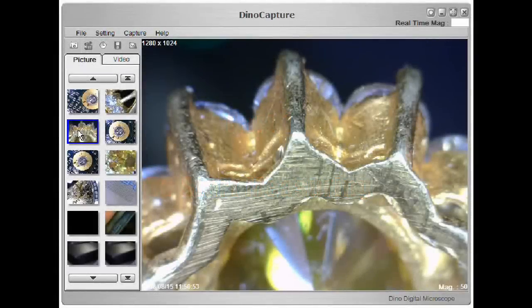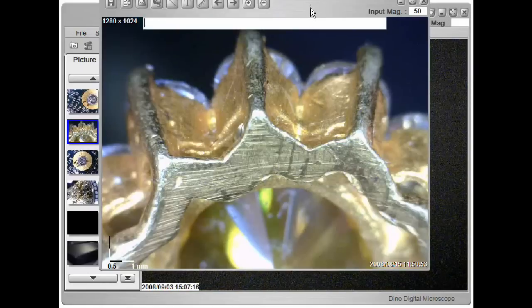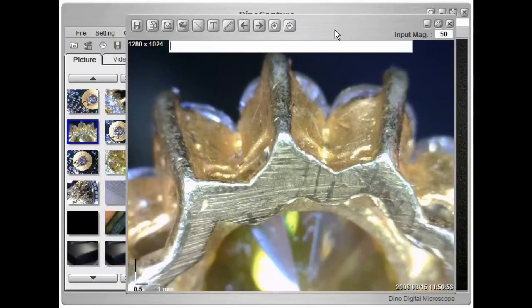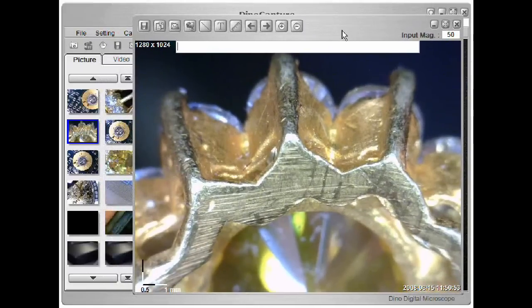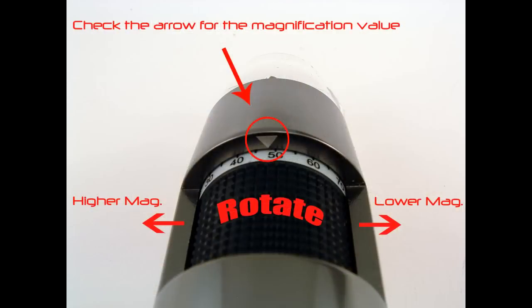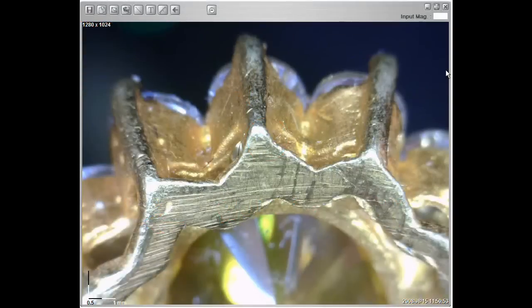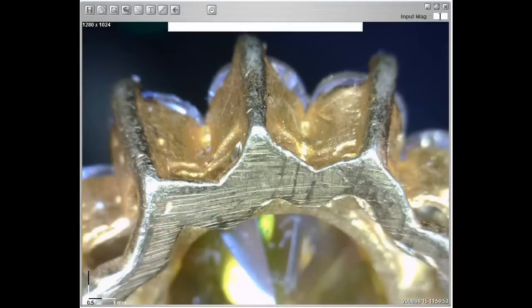To start measuring, double click on the thumbnail of the picture you wish to measure, which will open an editing window. Check the scope for the magnification value, then input the magnification.